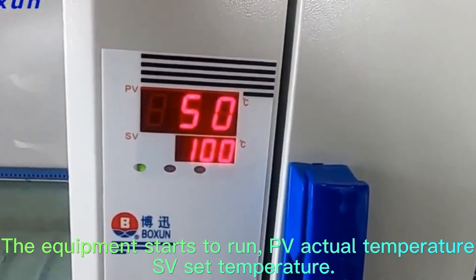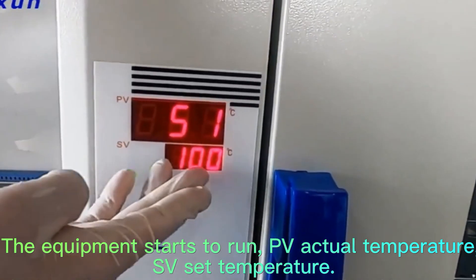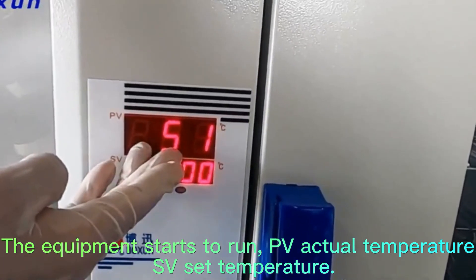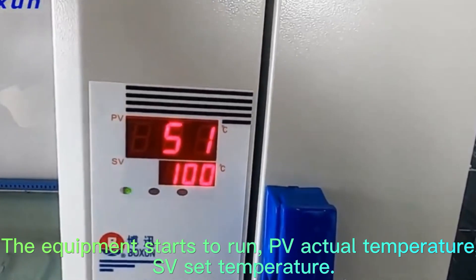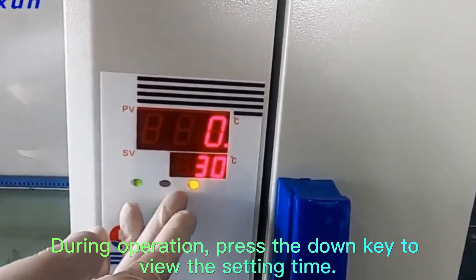The equipment starts to run. PV shows the actual temperature and SV shows the set temperature. During operation, press the Down key to view the setting time.